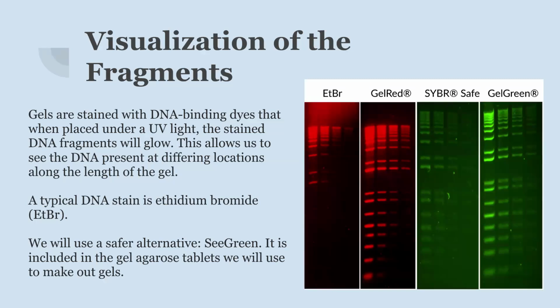It's to the point where, like, Dr. Estep, when he runs his labs and does his DNA analyses, the entire countertop is covered in ethidium bromide. They don't want you to touch anything on the counter until it's been decontaminated at the end of every semester. It's that big of a deal.